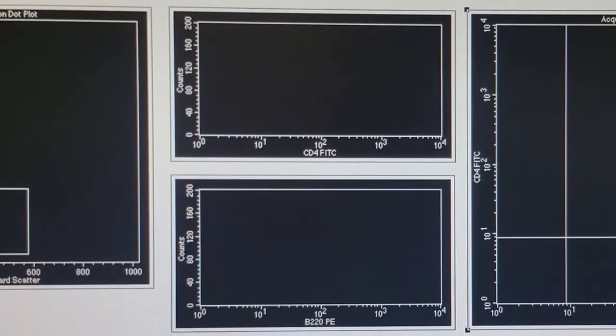The second windows are two different histograms. These histograms are going to show in real time if the cells are positive for the fluorescence we're looking for. The top histogram is going to look for CD4 — we're using antibodies that recognize CD4, and those antibodies are conjugated to the fluorochrome FITC, which fluoresces green. The bottom histogram allows us to visualize B220, which is a marker found on B cells. In this case, we're using antibodies that recognize B220 and are conjugated to the fluorochrome PE, which fluoresces red.